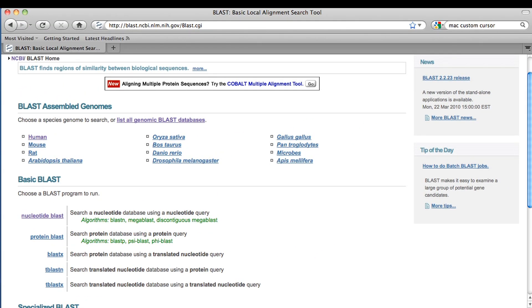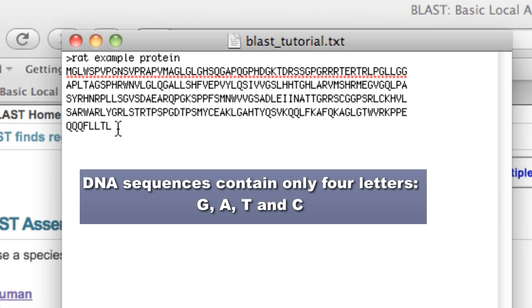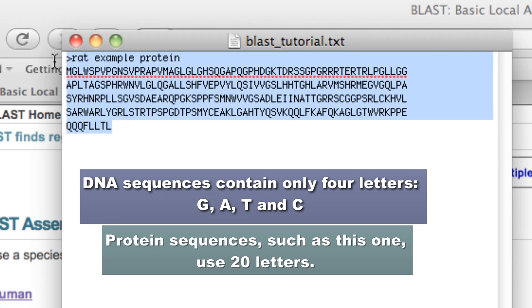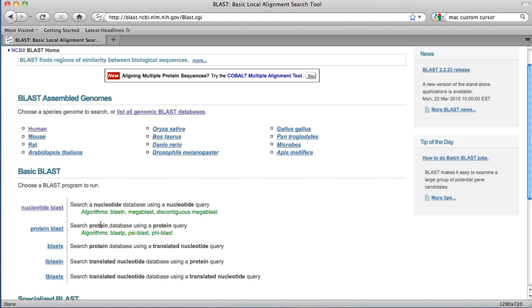I'm going to open up the sequence that we're going to use for this exercise, and the sequence is called rat example protein. You can see from the letter code that this is a protein sequence — these are amino acids, not just the four nucleotides. This sequence is in FASTA format, meaning that it's got a title plus the sequence. So I can put this on the clipboard and copy it. And because this is a protein sequence, I'm going to open up protein BLAST.